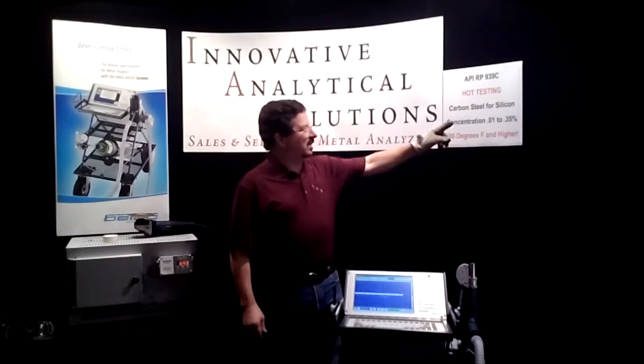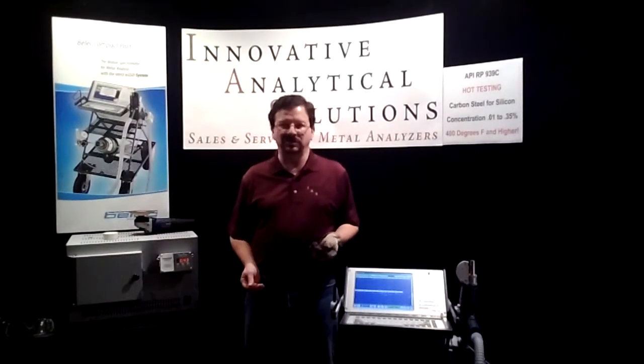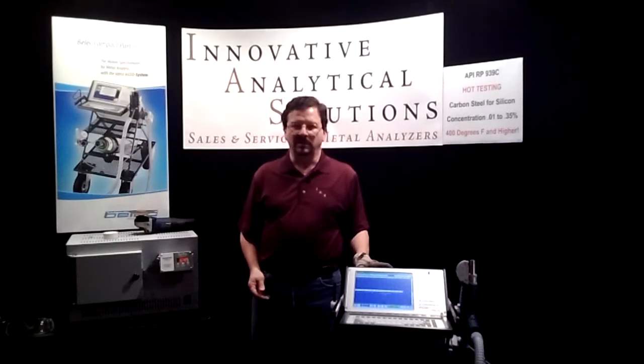Today we're going to address API RP 939C, the detection of sulfidation by using silicon analysis with the arc emission spectrometer.